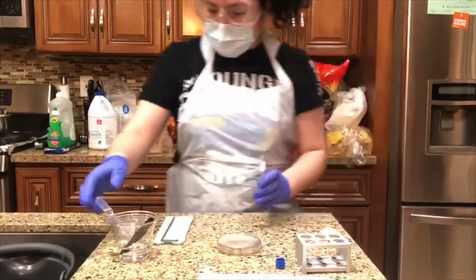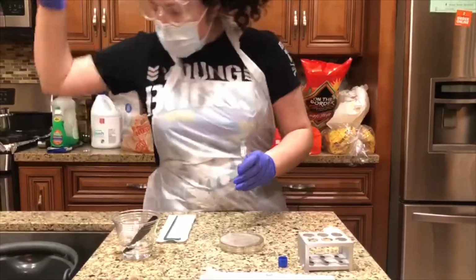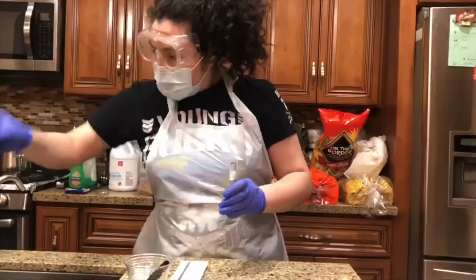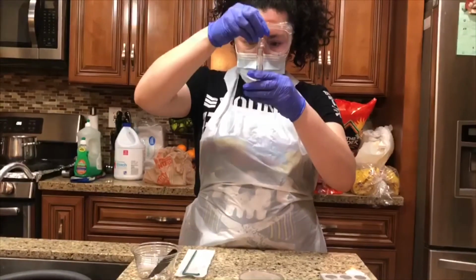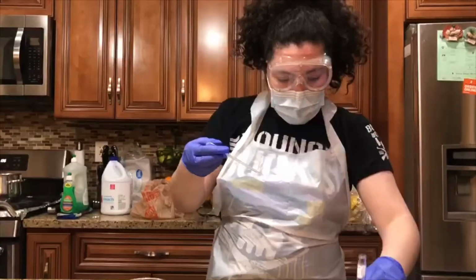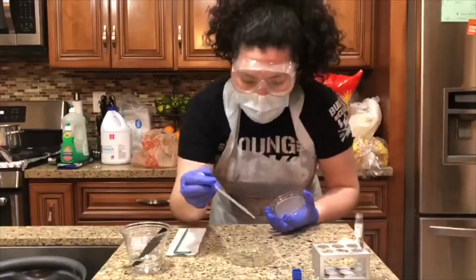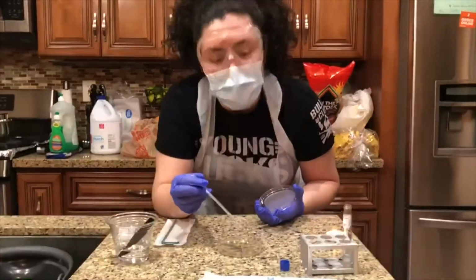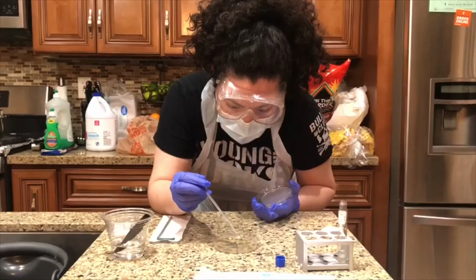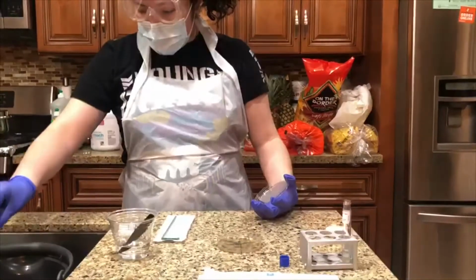There we are. I'm going to get my pipette. Make sure I have all the alcohol out. Okay. I'm going to draw up 0.5 mLs, approximately 0.5. There we are. I'm going to set that down. Remove the lid from the agar plate. And right in the middle, I'm going to drop a total of 8 drops of the active culture. 1, 2, 3, 4, 5, 6, 7, 8. Okay, then I put this pipette in the bleach.